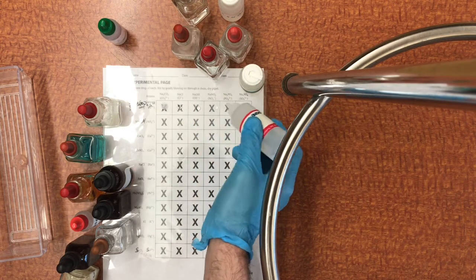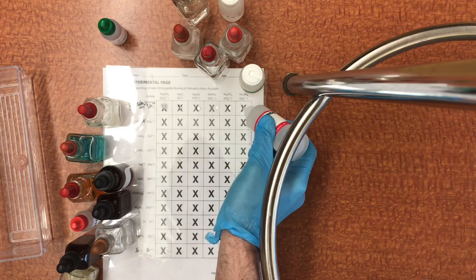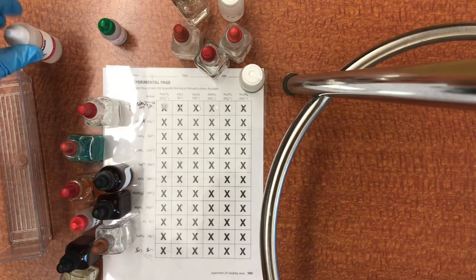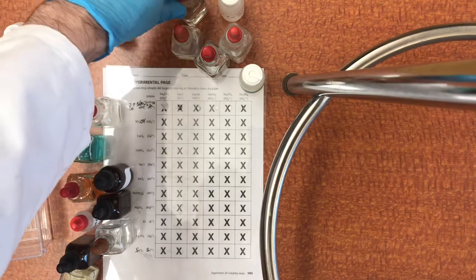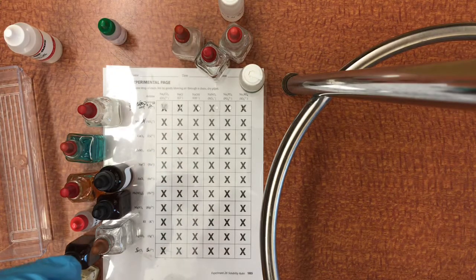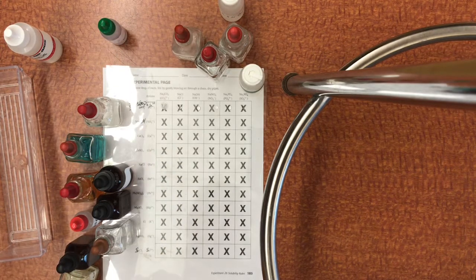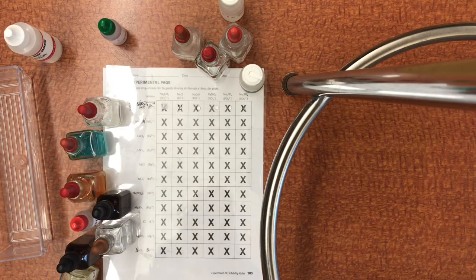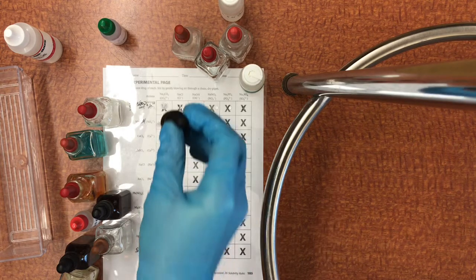So I'm just going to put some drops here. Oh, try not to mess up. If you put them on the X, you can actually see a really nice reaction very clearly. So there's my barium. So now I'm going to use a source of chlorine. It doesn't really matter, I guess I'll use sodium chloride. I have it anyways. So here's some sodium chloride here. So barium nitrate mixed with sodium chloride.